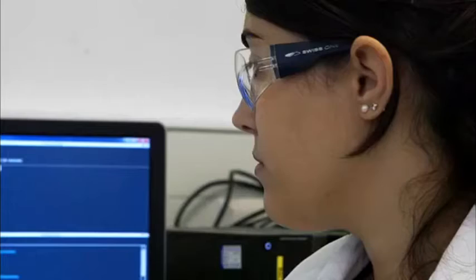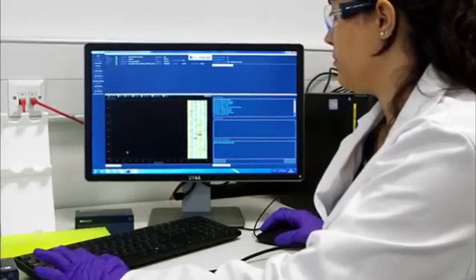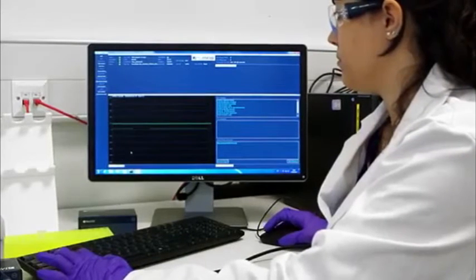And that means if you have an experiment that's looking for a particular thing, whether it's a significant mutation or the existence of a particular strain in a laboratory swab, you can detect and see that with a required level of confidence in real time. If you can see things in real time, you can then feed that back to the system, and you can move the whole system or part of it onto another sample or another experiment.